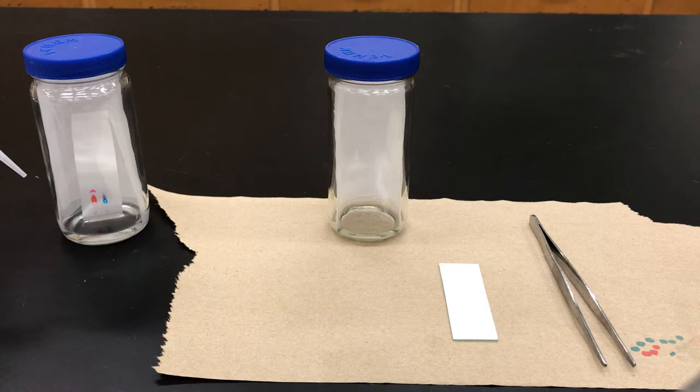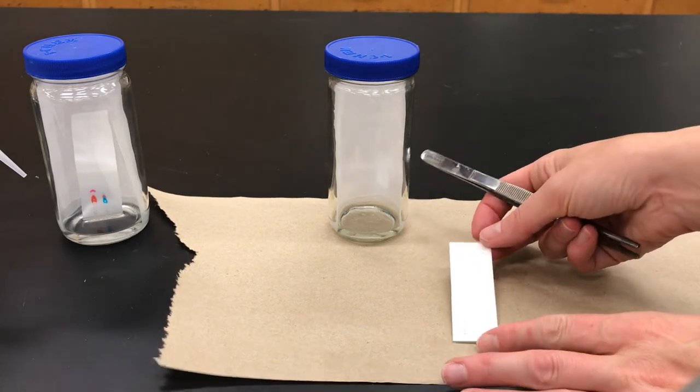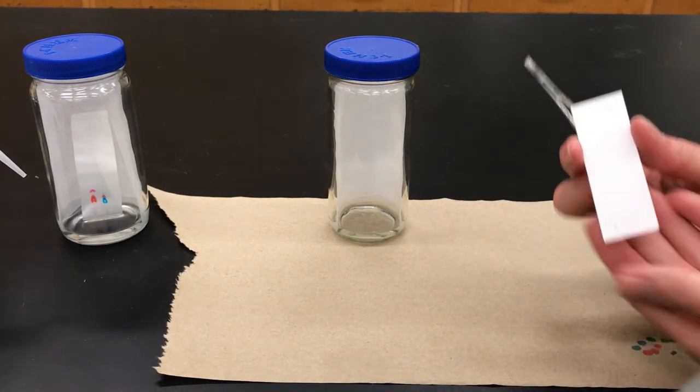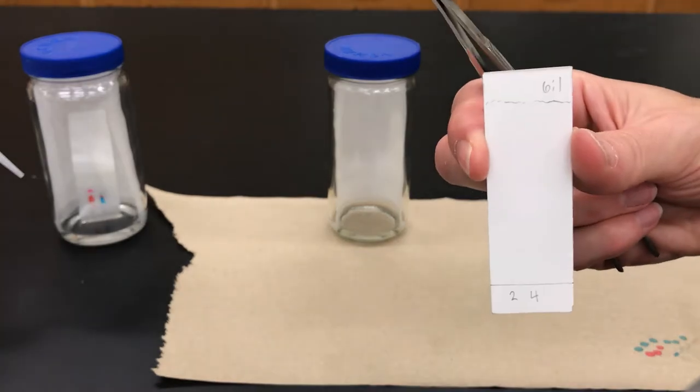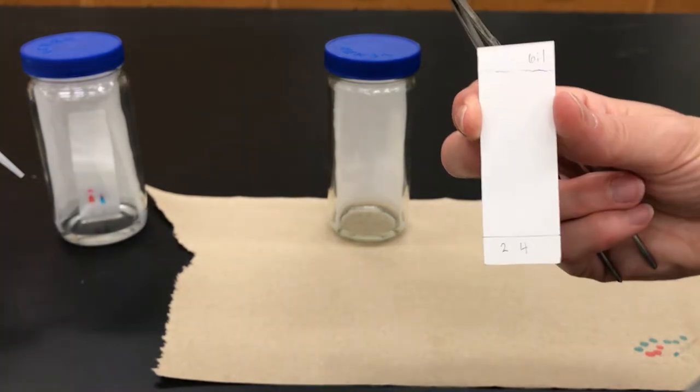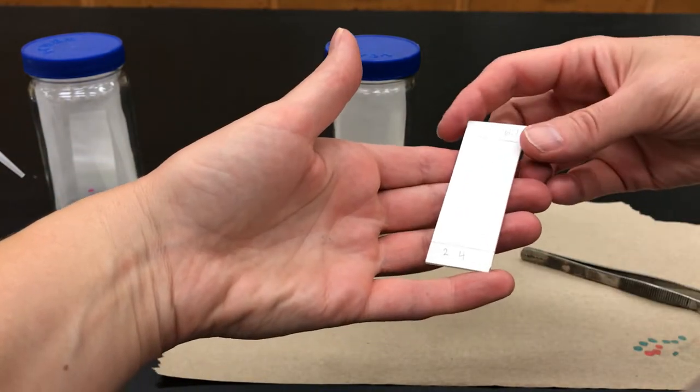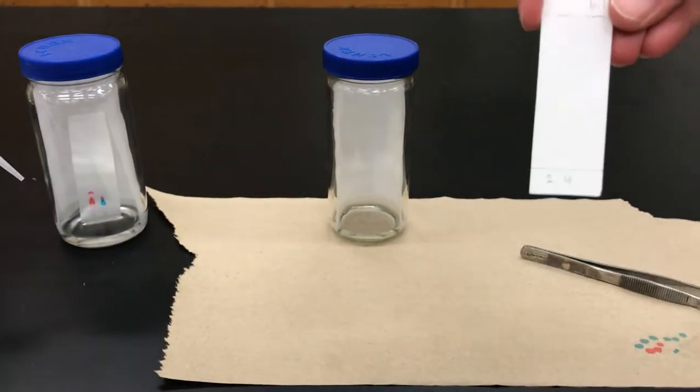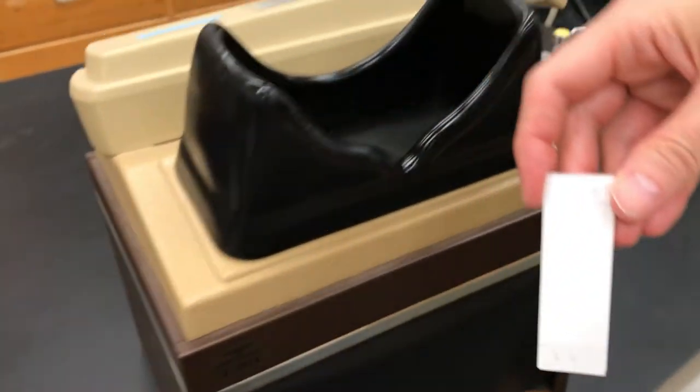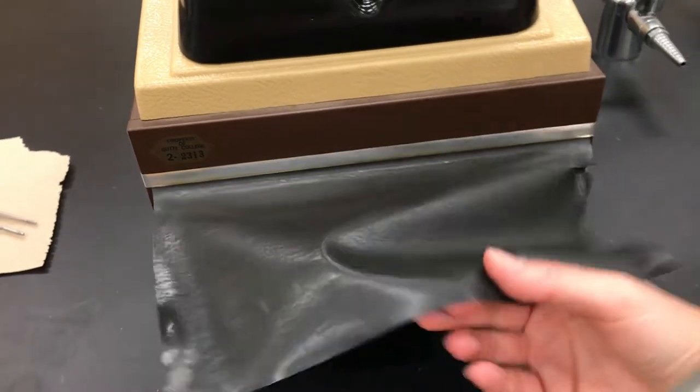It's more common that organic compounds are invisible to the naked eye, and so you have to do something afterwards to see where the spots ended up. For example, here is a TLC that I ran in the last video and there are molecules there, we just can't see them. So we have to do some sort of visualization technique to see where they ended up. Probably the most common technique is to use ultraviolet light because many organic compounds absorb UV light.